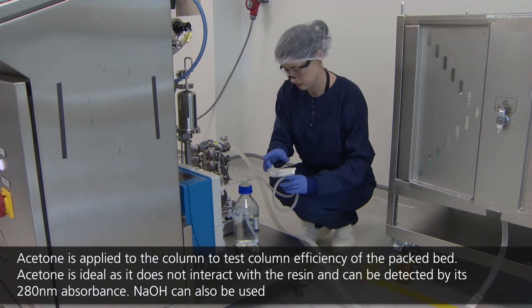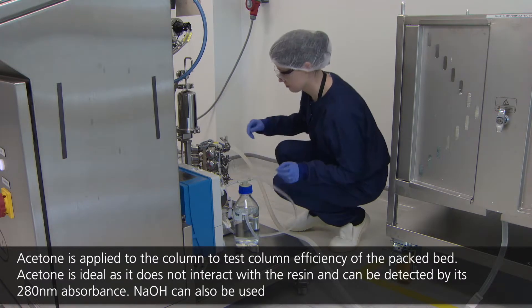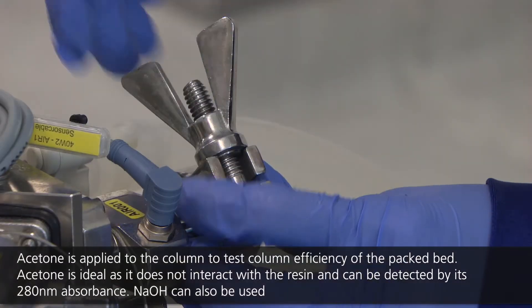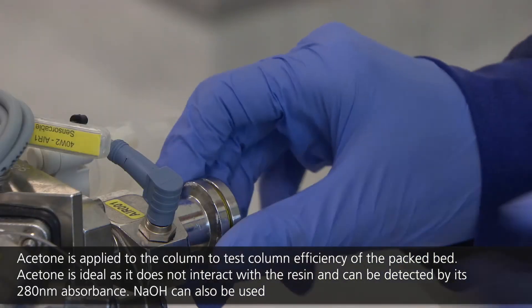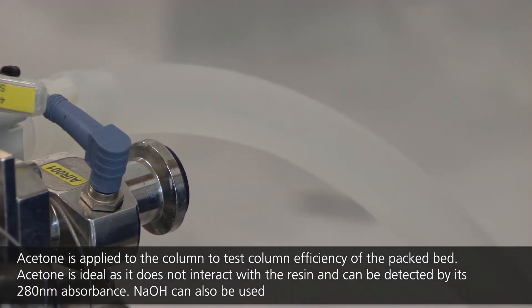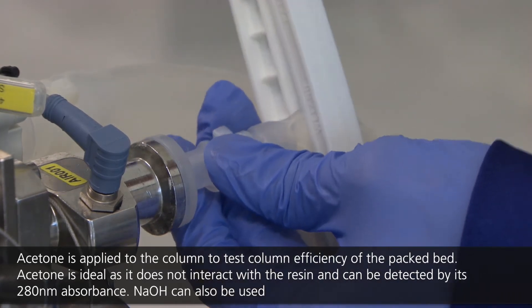To measure the efficiency of the column packing process, the column may be tested with a tracer substance. The operator connects the tracer substance — a 2% acetone solution in water — at the rear of the chromatography skid. This tracer is pumped onto the column and moves through the column as a band of liquid until it reaches the UV detection window.